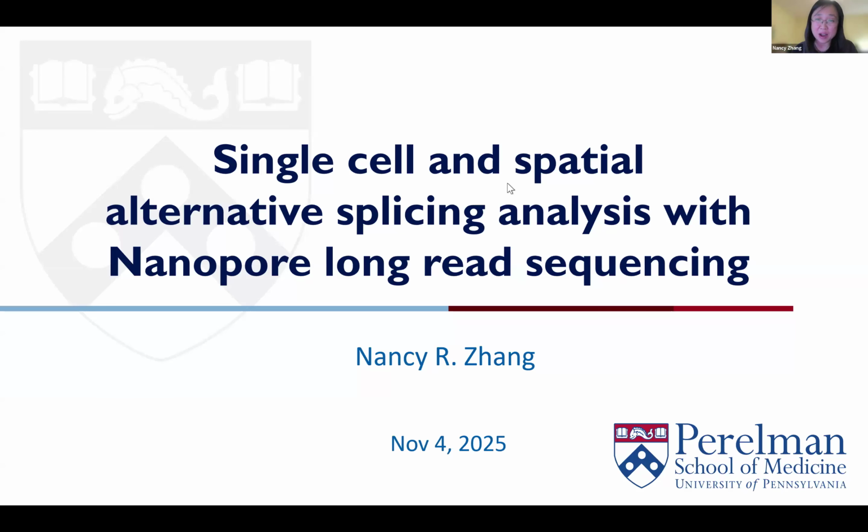So I'm presenting to you this work that was many years in the making. This is our attempt to analyze single cell and spatial nanopore long-read sequencing data, trying to identify spatially specific and cell type specific alternative splicing. I'm going to try my best to convey this work to you.